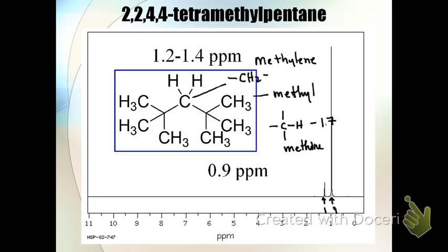We usually do this as a graphic integral, which is a graph of the integration of the signal. But sometimes more modern instruments, and ours will do both, will give you both the numeric integral as well as a graphic integral that you can measure with a ruler.